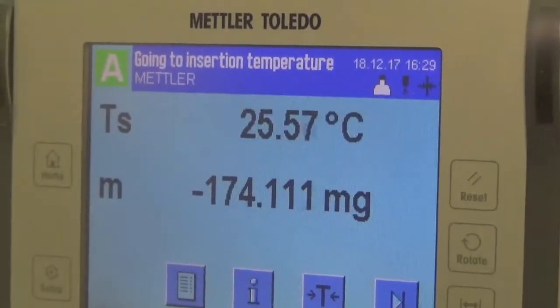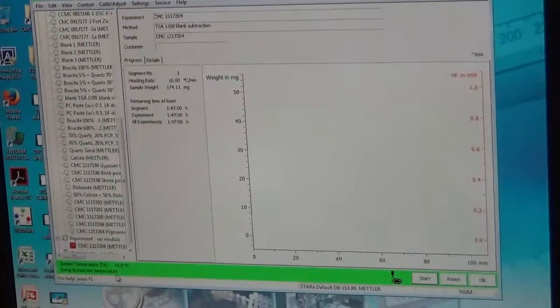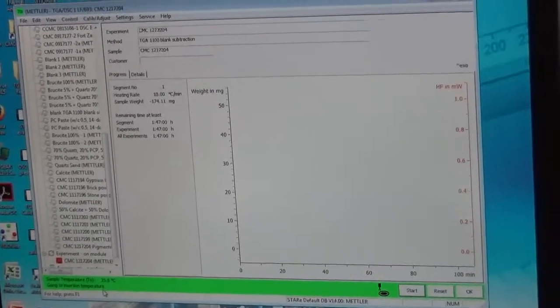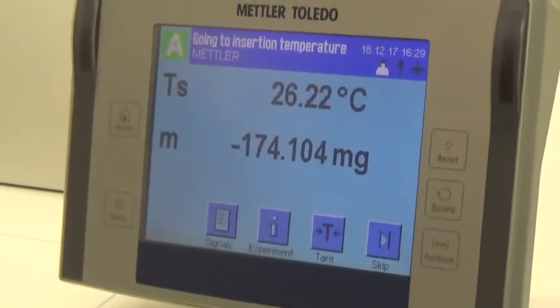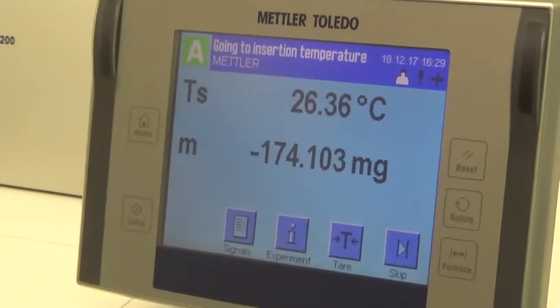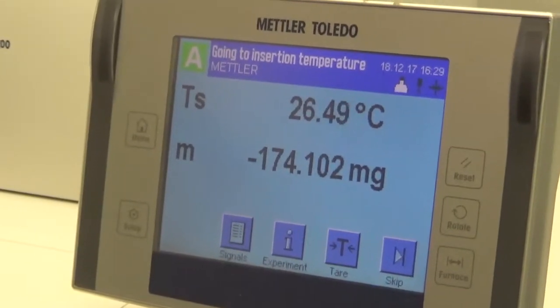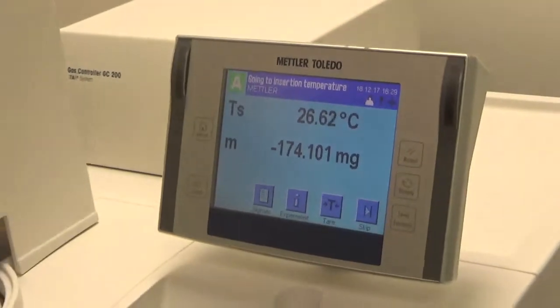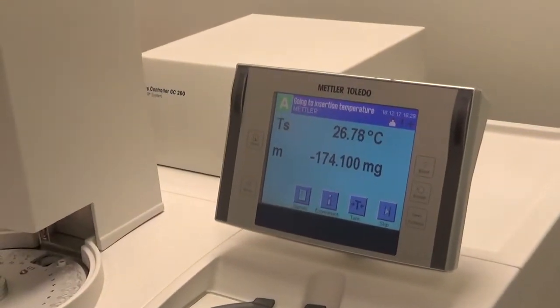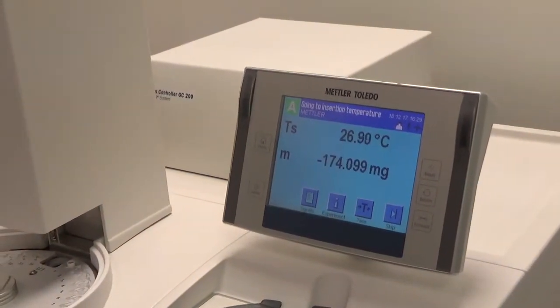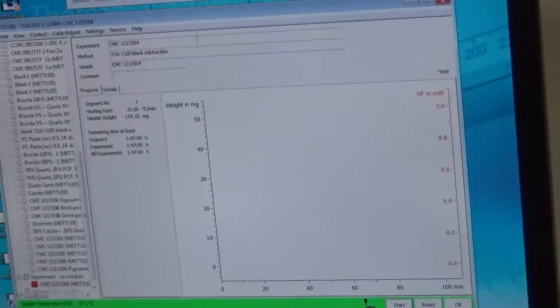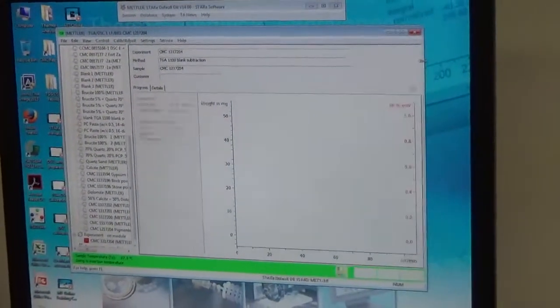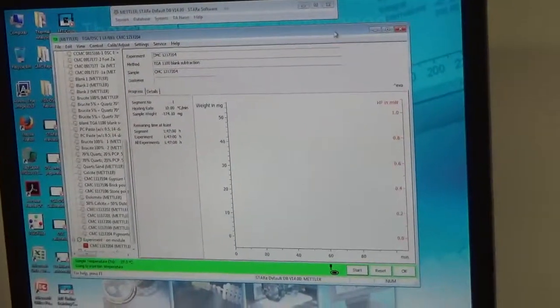It says it's going to insert to the start temperature of 30 degrees. It also shows on the touch screen where the temperature is rising. It will wait until it goes to 30 degrees. Once it reaches the insert temperature of 30 degrees, it picks up the sample and loads it. While the software is running and the experiment starts, I'm going to show you how we create the report from a previously run sample.